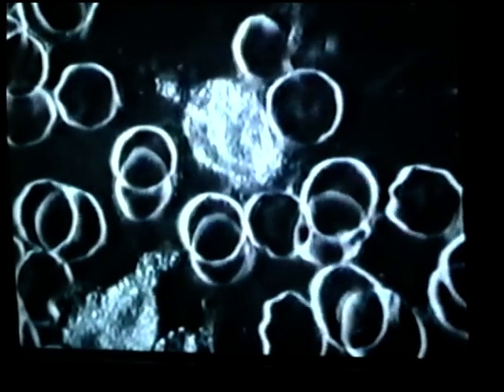Now look at the difference in these white blood cells as far as their ability to stream and flow and to reach out and clean up the area around them. A lot more streaming. A lot of improvement in the action as far as the special forces being able to really activate. You have several areas that are streaming now. You can see right here where the kind of pseudopod or the finger is reaching out. You can see all of this activity right in here. A lot of granulars that are loaded with histamine and enzymes reaching out to digest the debris.